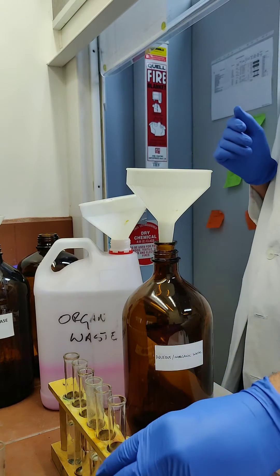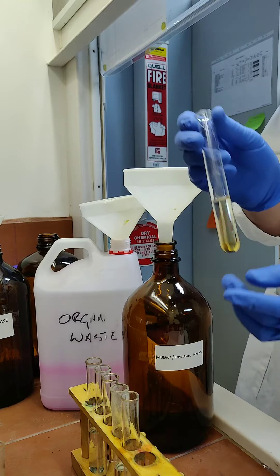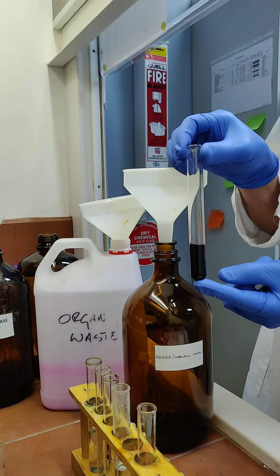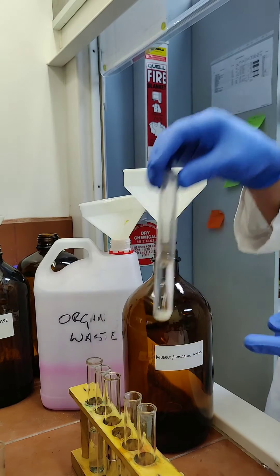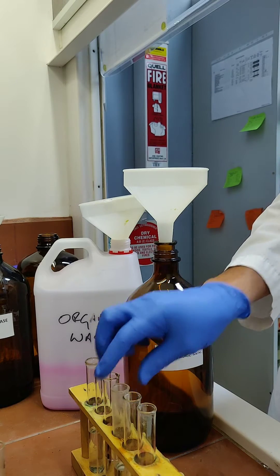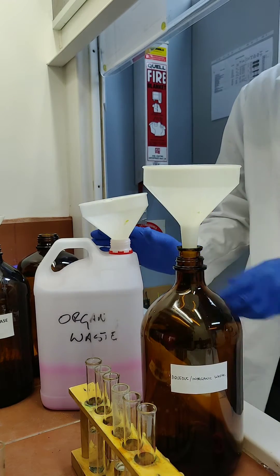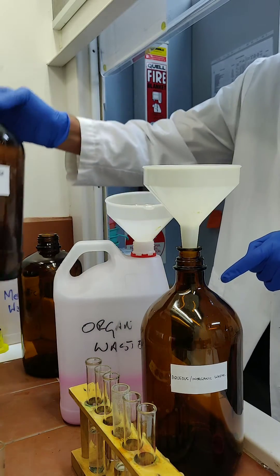We have some waste that we need to discard. We have a tube containing iodine crystals in water, a tube containing iodine crystals dissolved in cyclohexane, and another tube containing sodium hydroxide. So we have three waste streams: the aqueous/inorganic waste, the organic waste, and a mineral base.